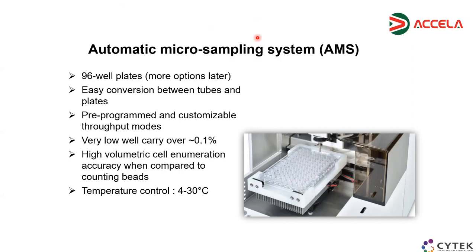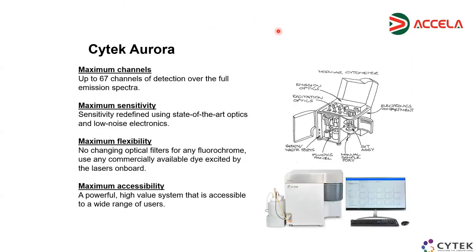Okay, so I would like to know how the system handles clogging if the cells are clustered. Is it required to sieve the cells, so just having single cells? Or can it be a problem, clogging the system? That's one question. The second question is how the tubing is handled. For example, if you use propidium iodide or these kinds of dyes, which might cross-contaminate the tubing, and afterwards it requires cleanup. So how does this system handle these problems?